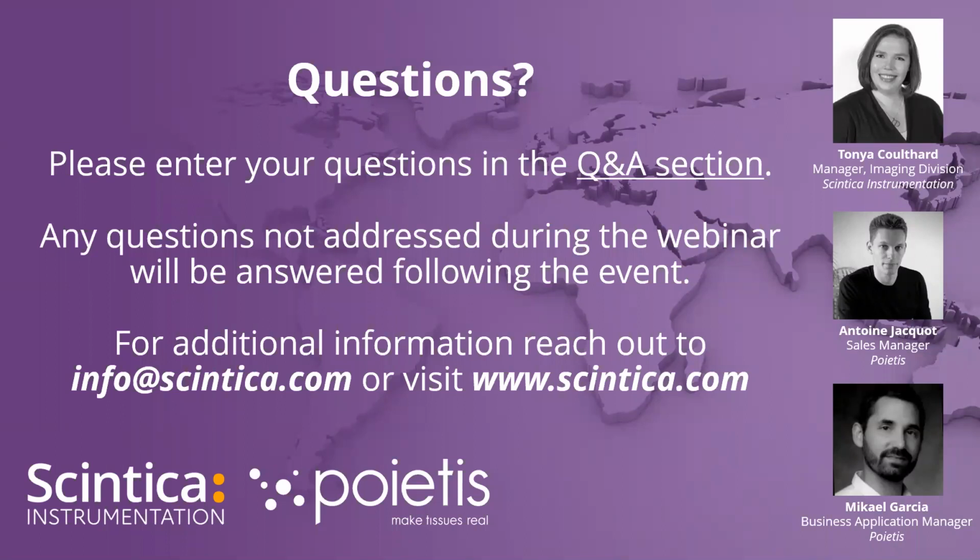between 1 and 3 cells, and we can go to hundreds and thousands of cells. So it really depends on your workflow, but yes, we can generate patterns of different sizes, and there are different ways to do that. Either by printing a single droplet, where usually you can print from 1 to 100 or 200 cells. And then if you repeat the printing of many droplets at the same location, like for spheroids, you can go over thousands of cells in the same spot.